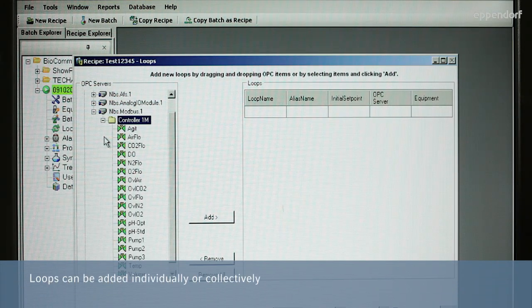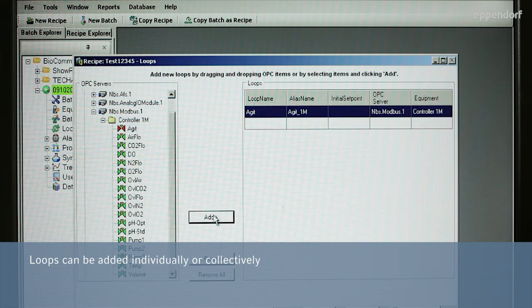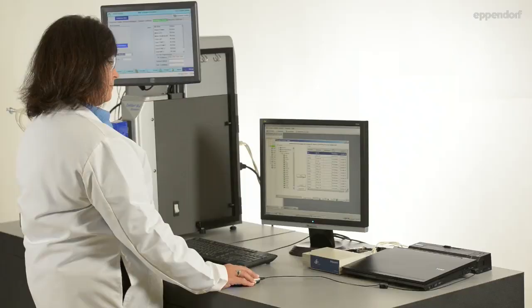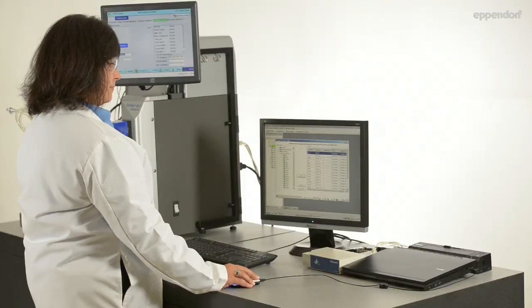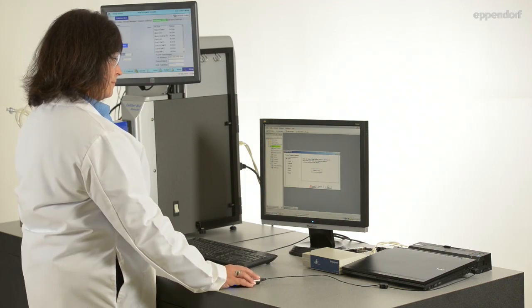Click on the plus sign next to the controller you will be using to open the list of available control loops. Click on the Save and Close button when you are finished adding loops to the recipe.